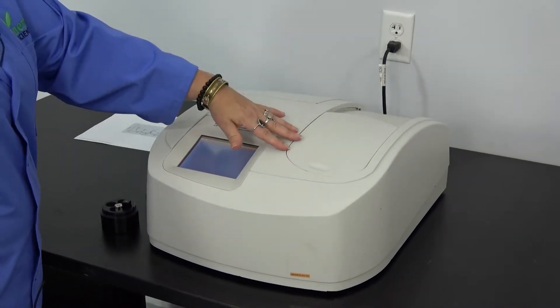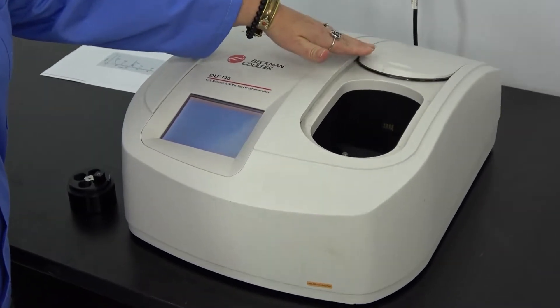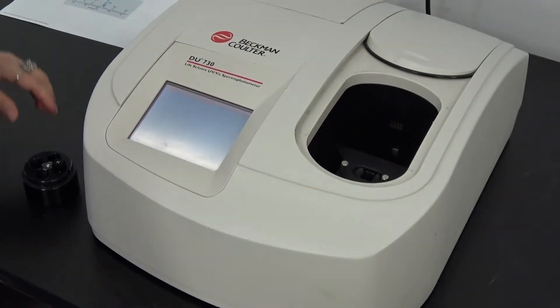It uses a focus beam design to allow people to scan small samples at superior resolution.